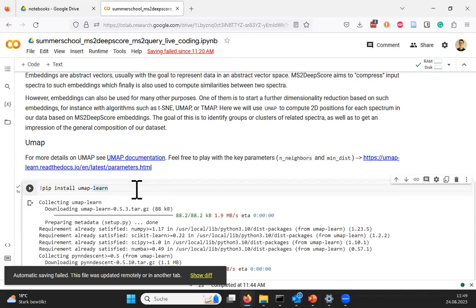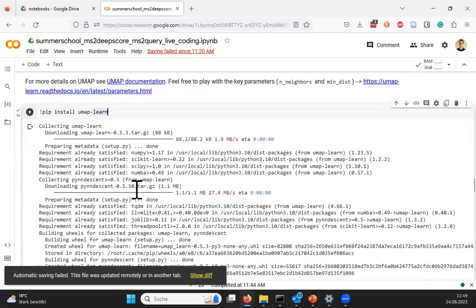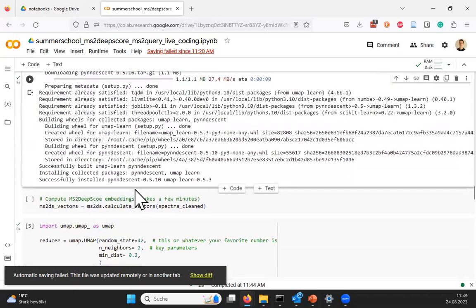And then, in the last 10 years, there are at least 2 tools that are fairly standard now. One is t-SNE and one is UMAP. I'm not going into details about these tools here, but they typically do a bit better job in compressing complex data. At least visually, it's usually what people prefer. And so we're going to do this with our vectors. For this, we have to install UMAP, which is also provided in Python, luckily.